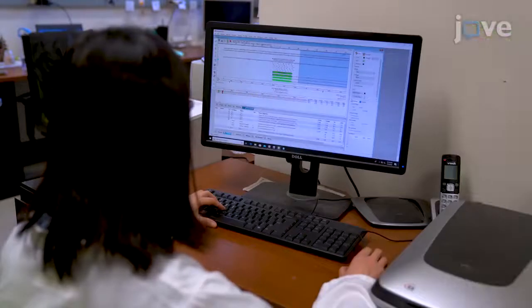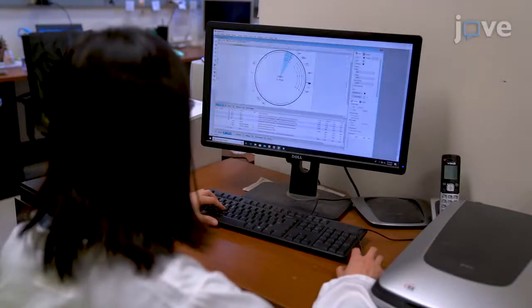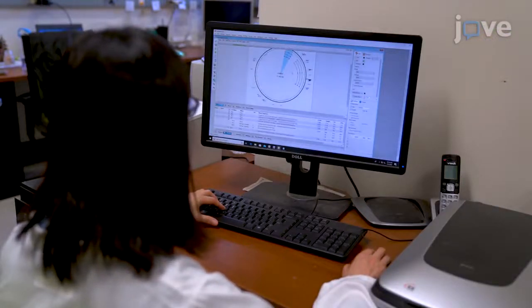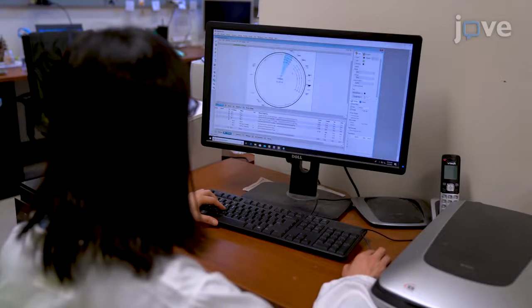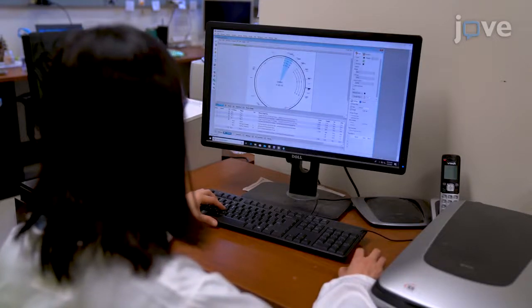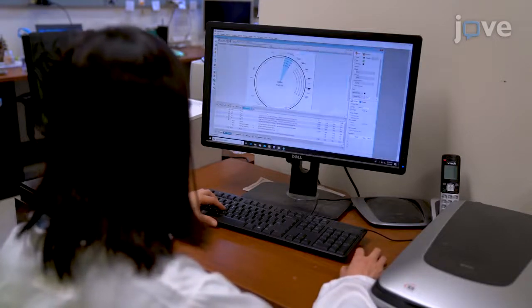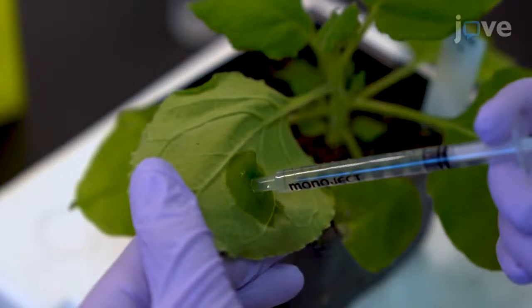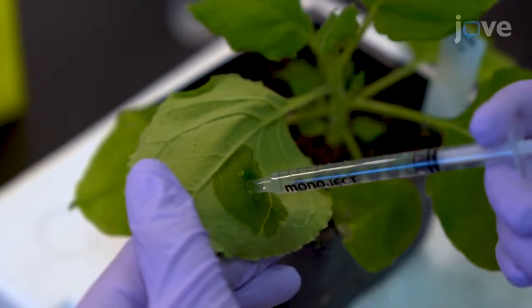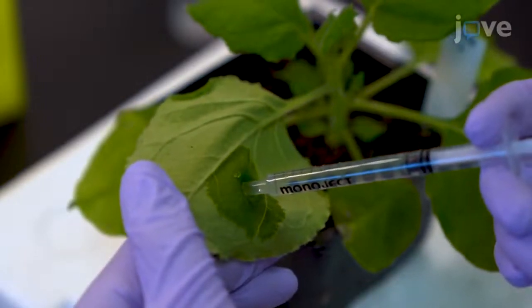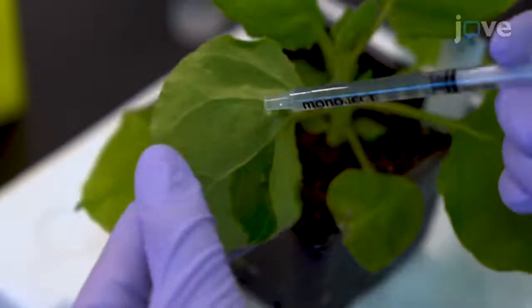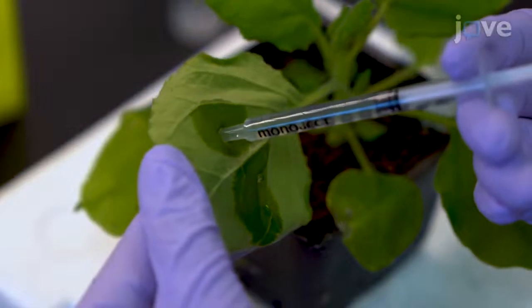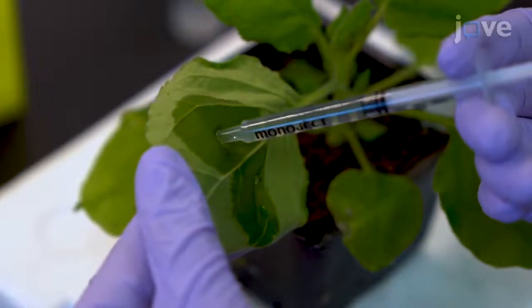Construct TurboID fusions and transform the plasmids into Agrobacterium tumefaciens competent cells as described in the text protocol. Use a 1-milliliter needleless syringe to infiltrate the inoculum into the abaxial epidermis of the fully mature Nicotiana benthamiana leaves.